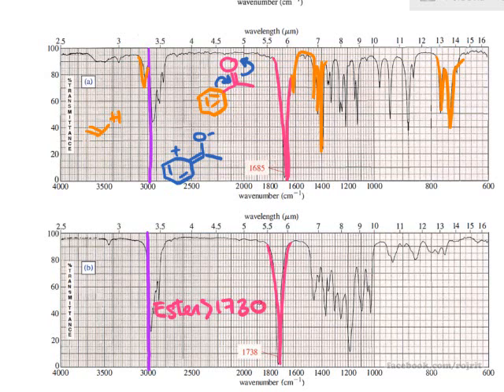I would say if you have the carbonyl beyond 1730, you can be sure that this is the ester. But when your ester is conjugated or in resonance with a double bond, maybe it drops down under 1730, and it will be more difficult. But when you see something higher than 1730, it's the ester for sure.